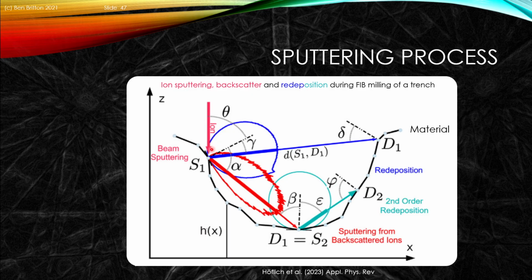We can also get another form of redeposition from the primary where it gets pushed forward, and we can get redeposition on the side of this. So this is super important as we're trying to, for instance, cut to make this hole bigger. What we can see is that the path of this ion beam, if it started here, is going to add to and shallow and make this trench more shallow ahead of the beam. So we're going to worry about how we scan or raster the beam across the surface with regards to the formation of redeposition and where those ions are redistributed in that material.